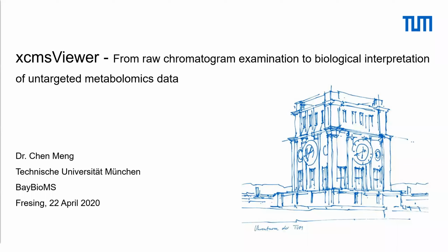So today we're going to talk about XCMS Viewer, and we want to see how it can facilitate our raw chromatogram examination and biological interpretation together. I will show you the design concept of XCMS Viewer and the application of the software using real-life data. So in the future, maybe you will have a collaboration with BayBioMS on untargeted metabolomic studies, then you can know what you can expect from us.